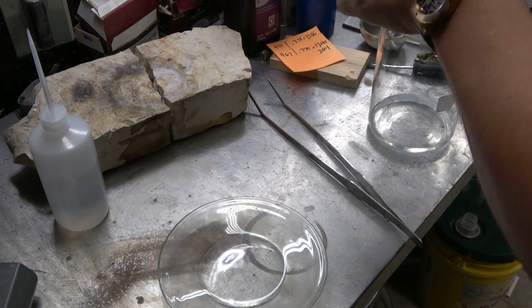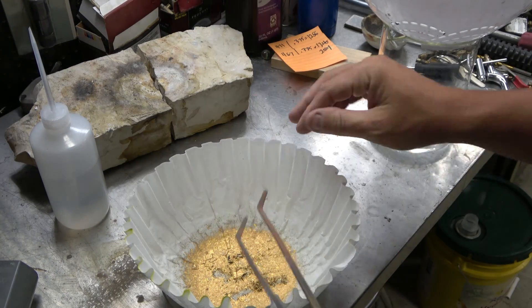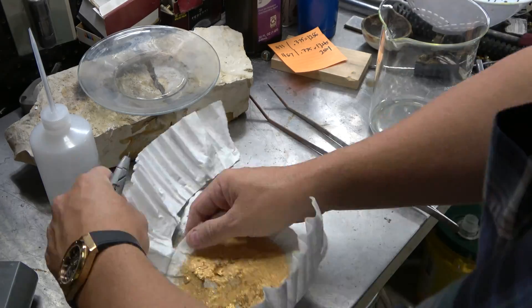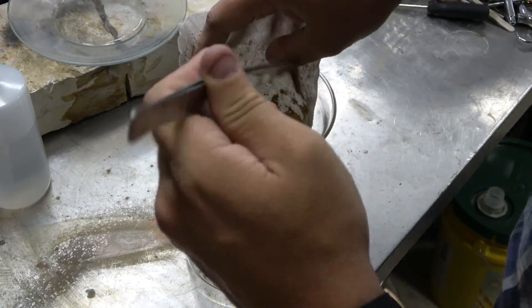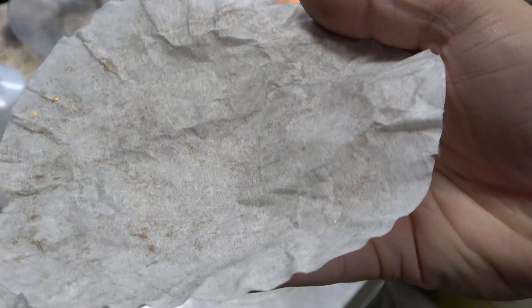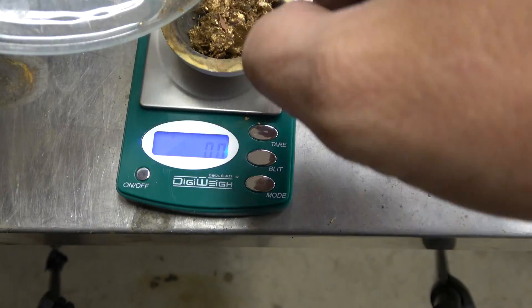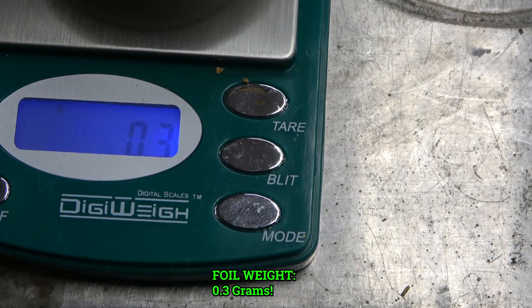I'm going to weigh the gold foils so you can see how much gold is just in the foils. Remember, this is not pure gold - it's pretty high purity but not pure. Taking the excess filter paper off, I'll scrape it into the beaker and then into a crucible sitting on a tared scale. Very minimal loss of gold, if any - any residue stuck in the filter paper goes in my pile for later. So, out of 2,500 SIM cards: 0.3 grams of foils. That's pretty disappointing.